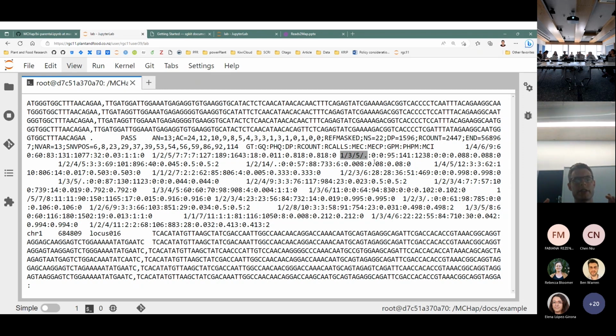And so the results we've got here for this assembly are not great, and that's because of that prior I mentioned earlier, that it's assuming the samples come from a population where every possible haplotype exists in an equal amount, which is an incredibly unrealistic assumption, but it's the only thing we really can do when we know nothing about the sample.